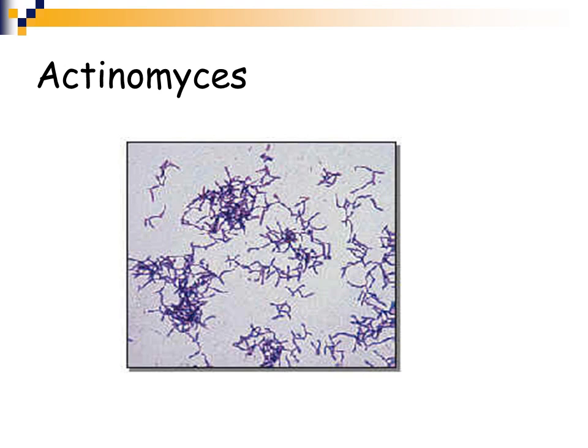Here's a gram stain of Actinomyces. This is a gram-positive branching organism. We mentioned Actinomyces way back earlier in the semester when we talked about our gram-positive branching rods. And the last slide said, keep in mind, Actinomyces is an anaerobe. So although it is a branching, somewhat filamentous positive rod, it's different from those in the fact that it is an anaerobic organism.